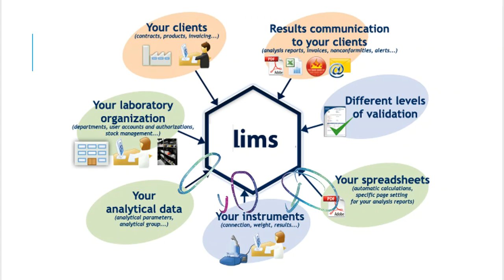Spreadsheets? Nobody said anything about spreadsheets. Isn't that what accountants do? And the answer is, well, no, not really. Okay. So the spreadsheets that you're going to see are basically Excel templates. And those Excel templates are already going to be made for you. The only thing that you have to do is download them, and you just fill them out, right?